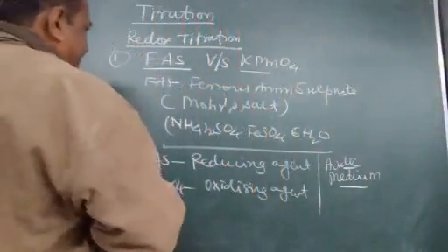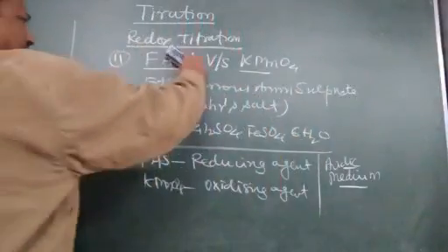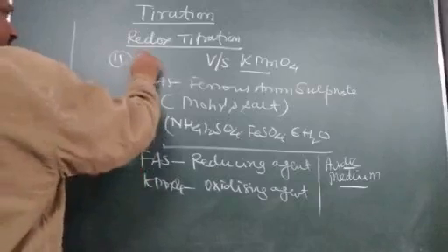Now the second titration is oxalic acid.